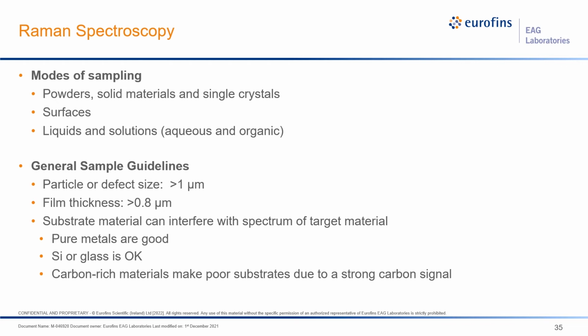So in some cases, it is prudent to transfer the sample to a different substrate for analysis, but in general, we can do Raman directly. And remember, with FTIR, our preferred mode is in transmission, which does require us to transfer the sample to a better substrate for transmission.